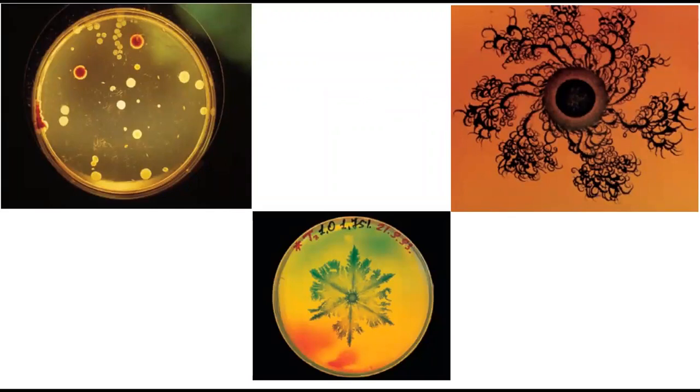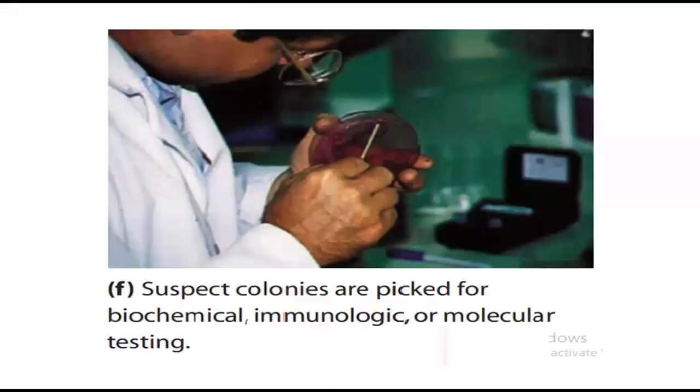So different microorganisms form different colonies. From this you can detect the morphology of the colony of the microorganism. So from here you can also detect that I am dealing with such a type of microorganism, but it is not that accurate. After that, what will you do?